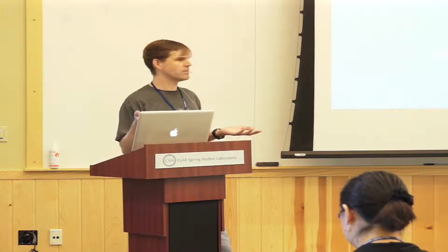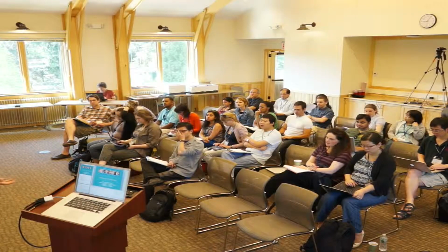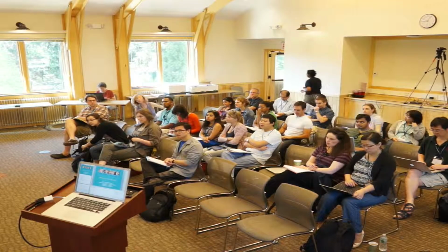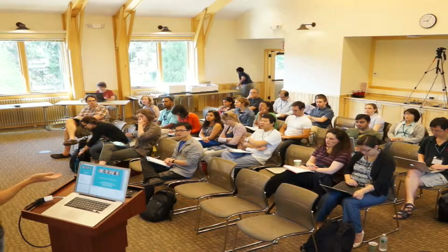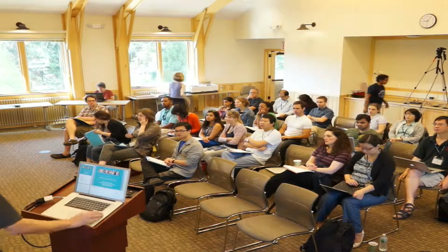So, I'm making the numbers a little bit extreme, but the point is that sometimes microarrays are perfectly good for answering your question. They're very fast, they're relatively easy to use, and still, compared to something like RNA-seq, they're cheap. And Naomi pointed out that one of the ways that we can improve power is by increasing sample size. So if you have a choice between something like RNA-seq and another technology like microarrays that, looking at them in many different ways, with many different measures, are equivalent in terms of measuring gene expression, but you can do 5 times more microarrays, do the microarrays. Okay, soapbox, I'm climbing down.